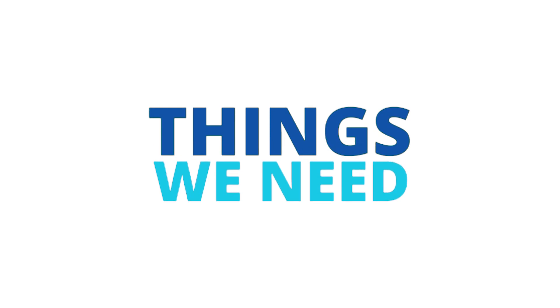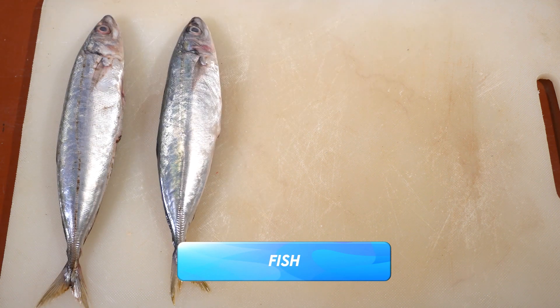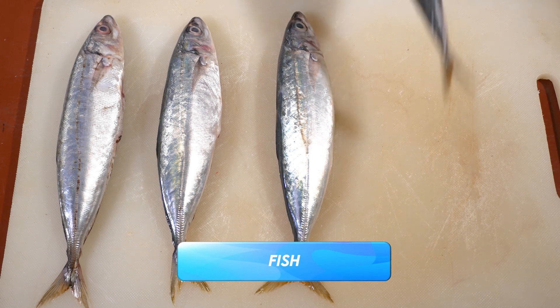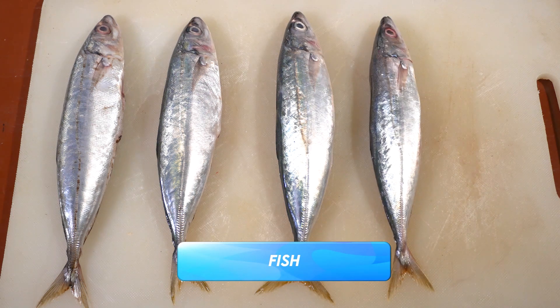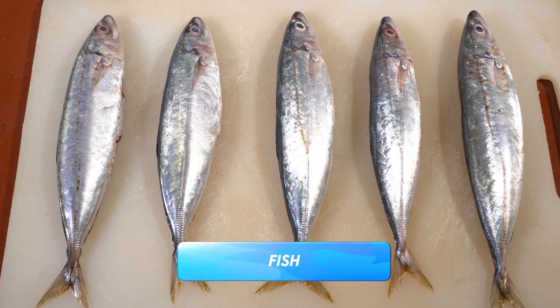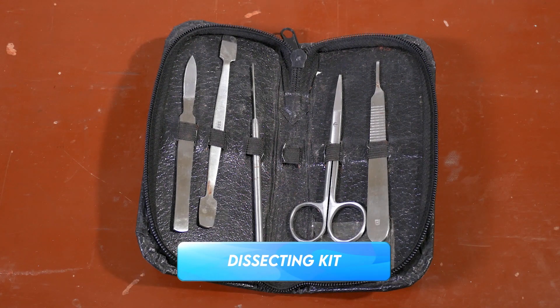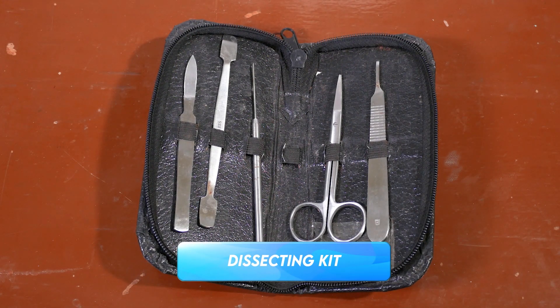Before we start, here are some things that you will need for the dissection process. Fish — you can use any species of fish, though it is advised to select a large fish for easier removal of the brain, as smaller fish tend to have smaller brains which are easily damaged during dissection. Dissecting kit — yours should include a pair of scissors, scalpel, forceps, and pins.